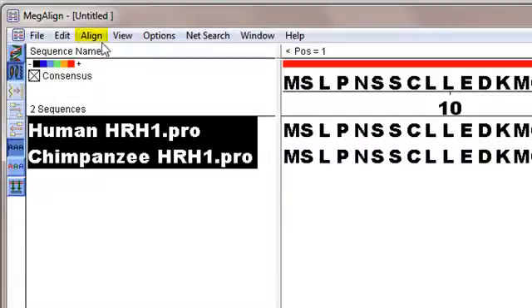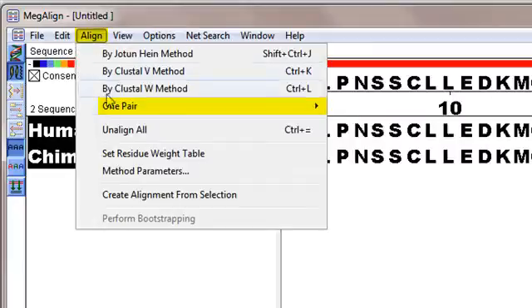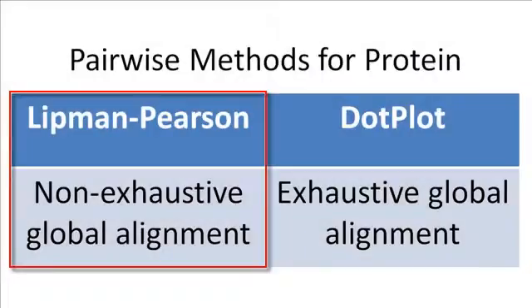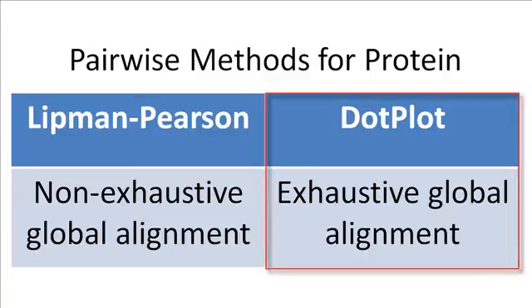For proteins, or for mixed protein and DNA sequences, the available choices are Lipman-Pearson and Dotplot. As you can see from this table, Lipman-Pearson is recommended if you don't need to do an exhaustive global alignment. Otherwise, Dotplot is the best choice.